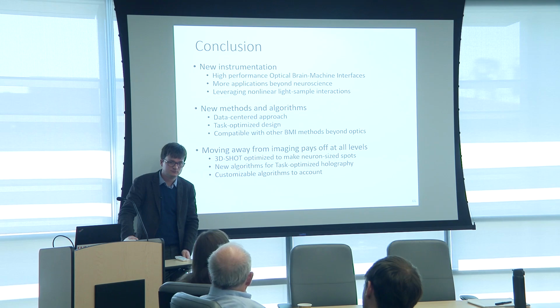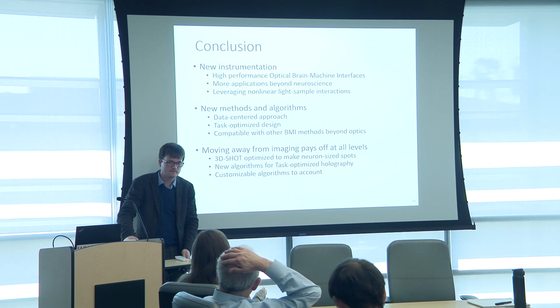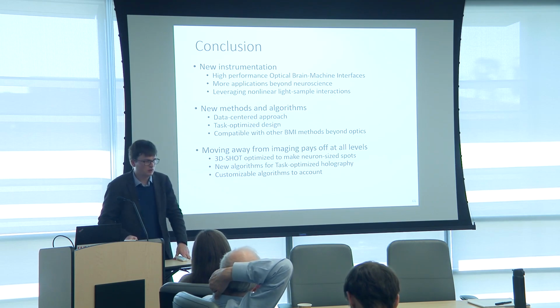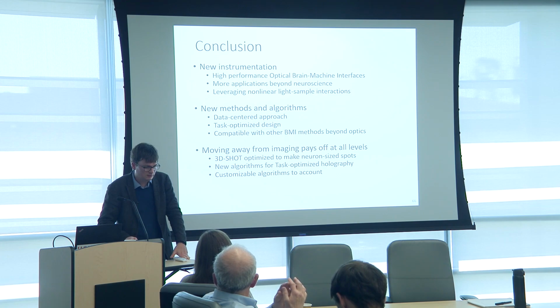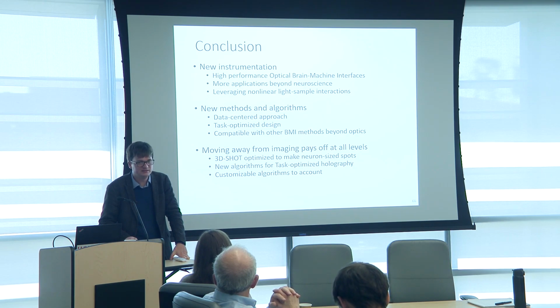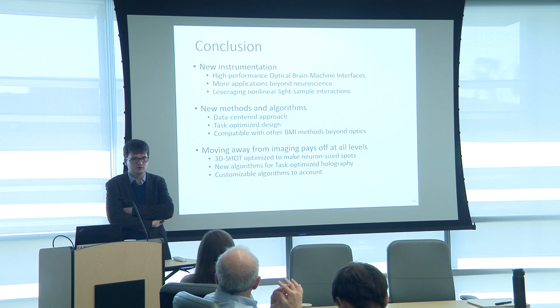I was just saying, you talked about how the problem is that there's heat in the brain when you do these 3D shot stuff. So what does that mean experimentally? How long can you run an experiment before you have to worry about damage? So with the options that were available as of 2018, we were able to excite 50 neurons every 2 milliseconds without significant or measurable brain damage across like 20 minutes of experiments. That's pretty much what the limiting factor was.